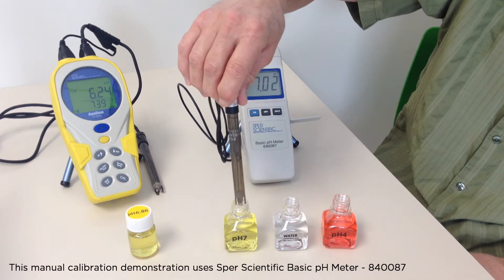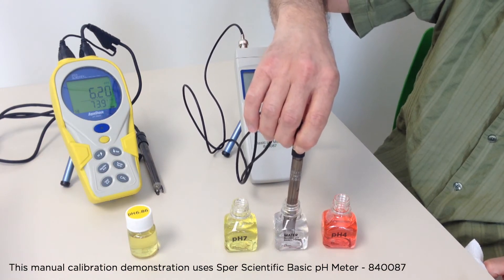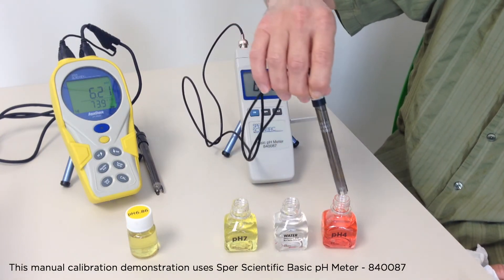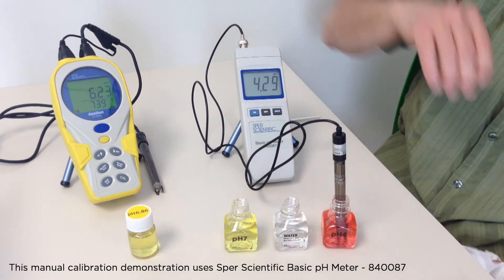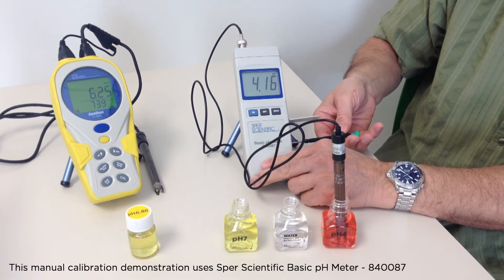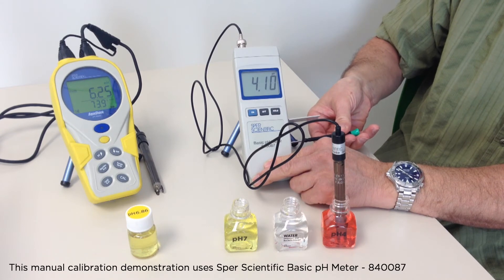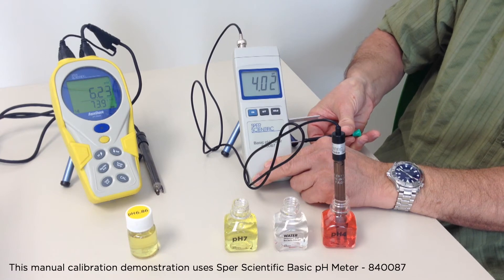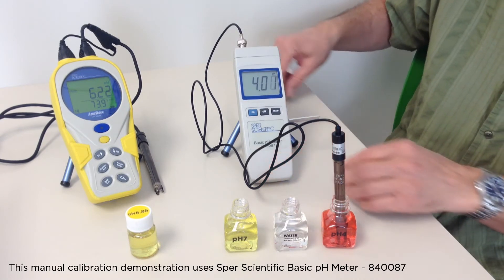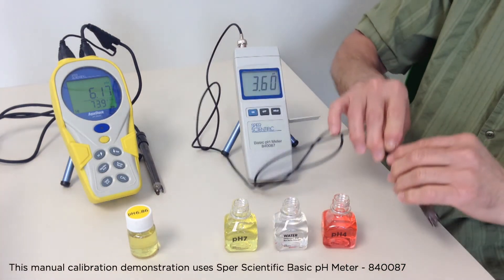Now I've calibrated this meter to pH 7. Next, I take the probe out, shake it off, rinse it in distilled water so that I don't contaminate the next buffer, shake it off, and put it in a standard buffer solution of pH 4. There is a second screw here labeled accordingly, and I just turn that screw until it reads pH 4. I've now done a two-point calibration — calibrated to pH 4 and pH 7.